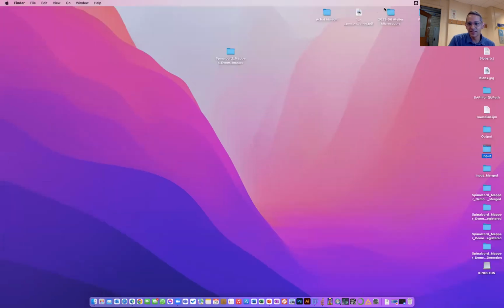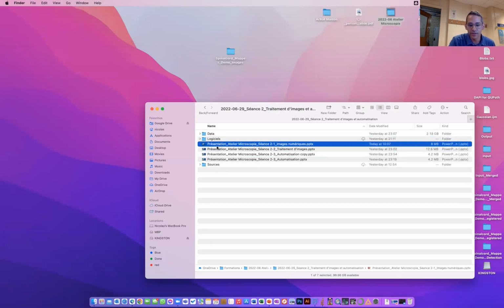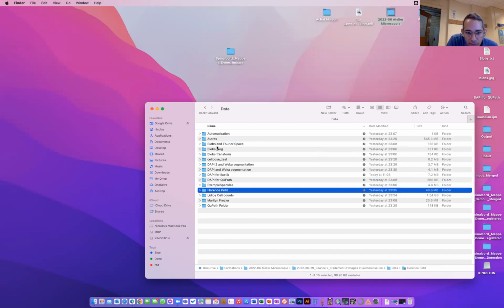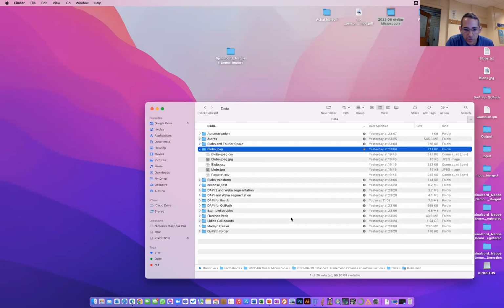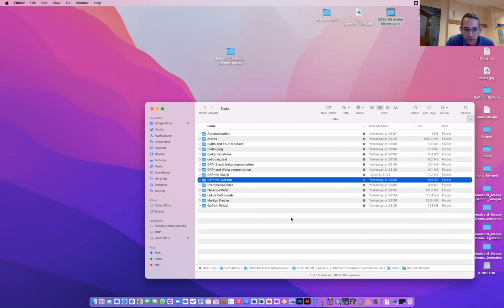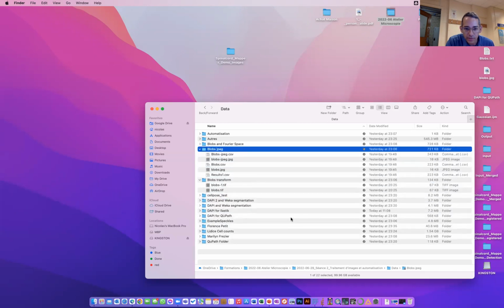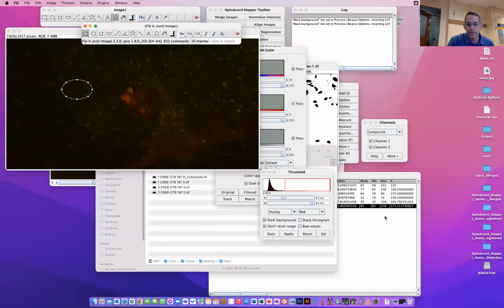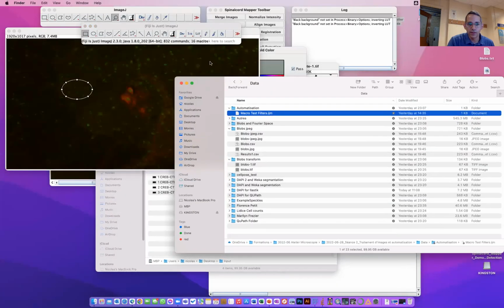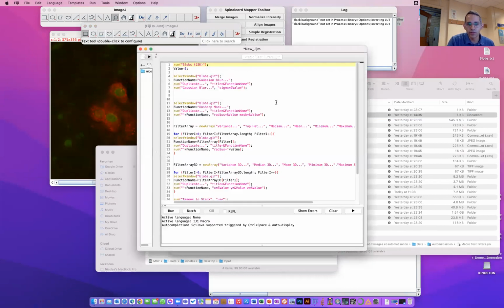Another thing I looked at was, if some people know a bit about scripting, they could write a script for making the blobs. Is it blob? No, it's not blob transform. I made a little macro, and I don't know where it is. The file is called cell pose test, blob transform. I made a little macro to show you guys, but oh, here. In the middle of a talk, I said, if you can write a small macro to do something automatized. And this is the macro I wrote last night.